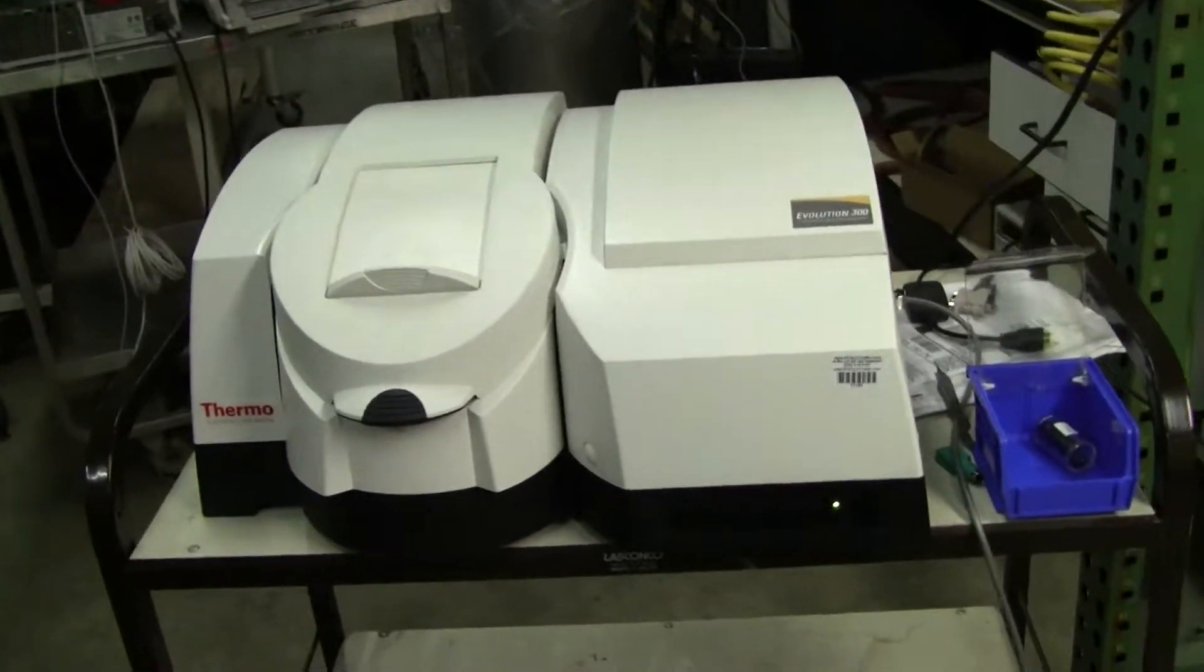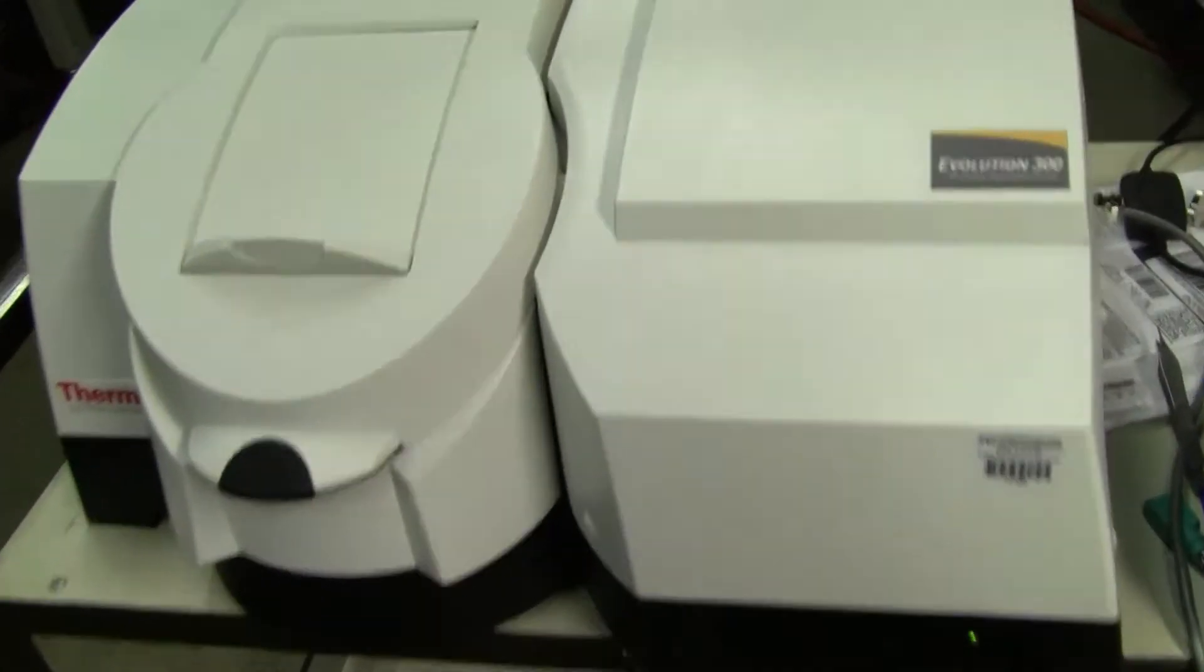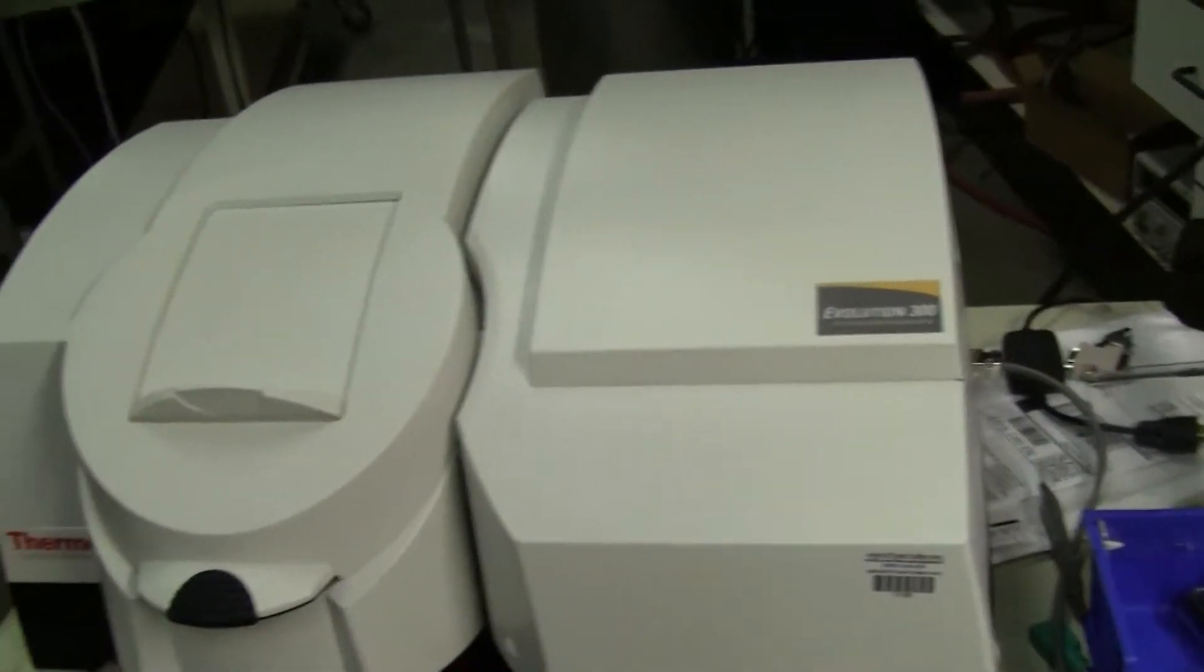Hi, this is Michael Naitow from HitechTrader. Today we're looking at the Thermo Evolution 300 UV Vis Spectrophotometer.